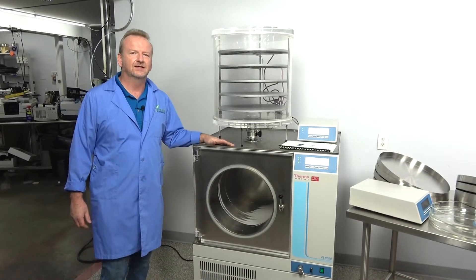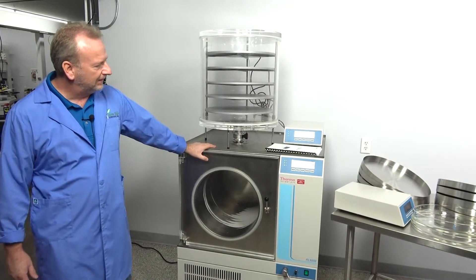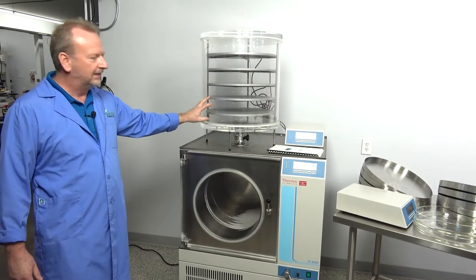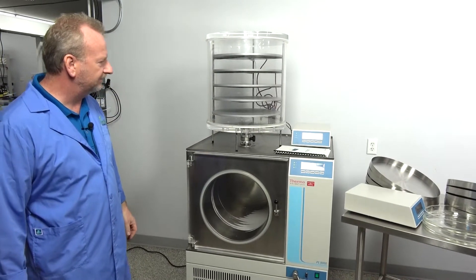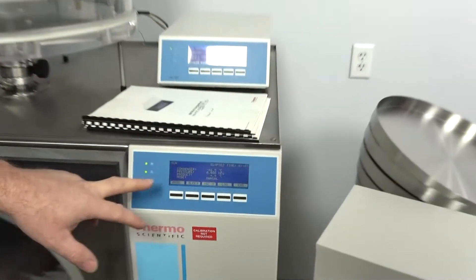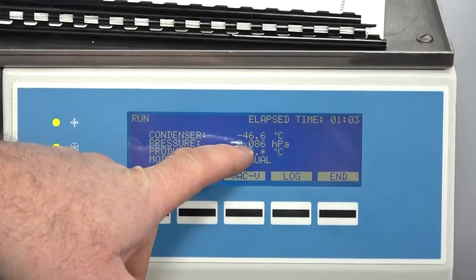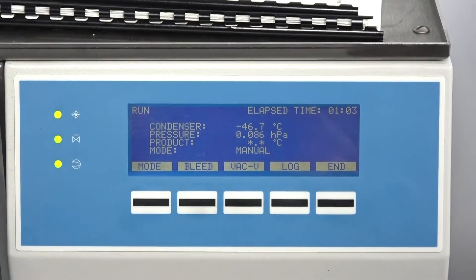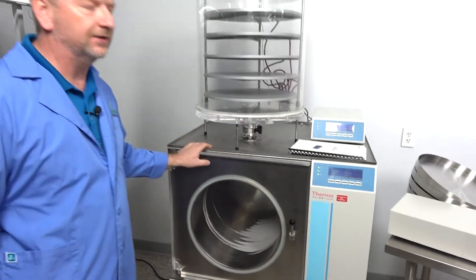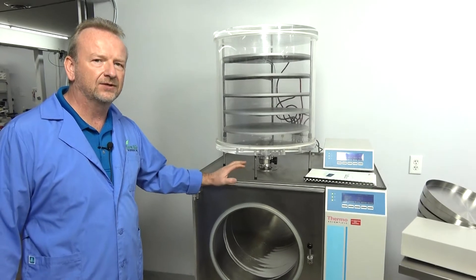Hi, I'm Rich with New Life Scientific and today we're shooting a video of this Thermo Scientific PL9000. It's a really nice freeze dryer that has a huge drying chamber. The chamber itself gets to typical temperatures of about negative 46 to negative 48, as you can see here, and the vacuum pressure is pulling down really well. We're actually using an Edwards XDS 10 scroll pump so there's no oil changes needed on this machine like there would be on a rotary type vacuum pump, which makes it nice.